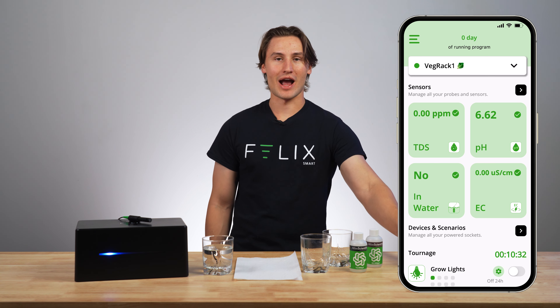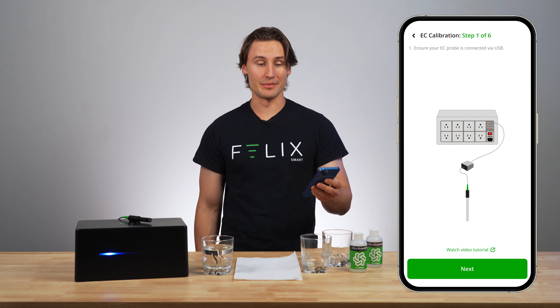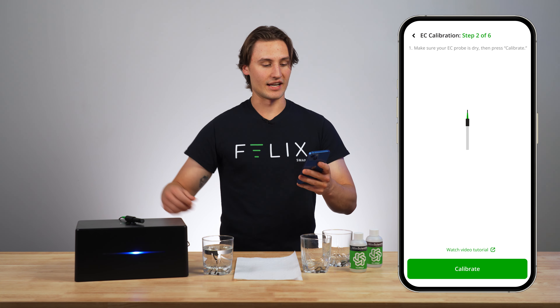The first thing you're going to want to do is grab your app and head into your conductivity probe, then press calibrate at the bottom of the screen. It says ensure that your EC probe is connected via USB, which mine certainly is. Now I can click next.